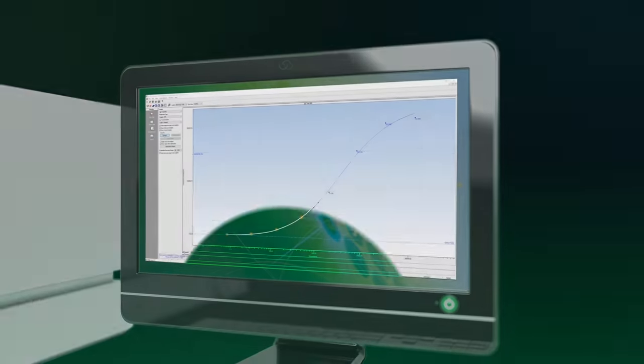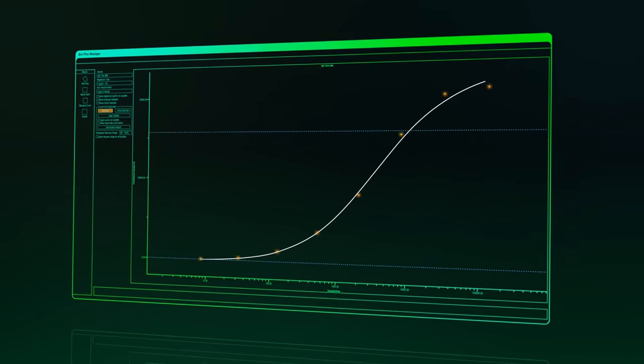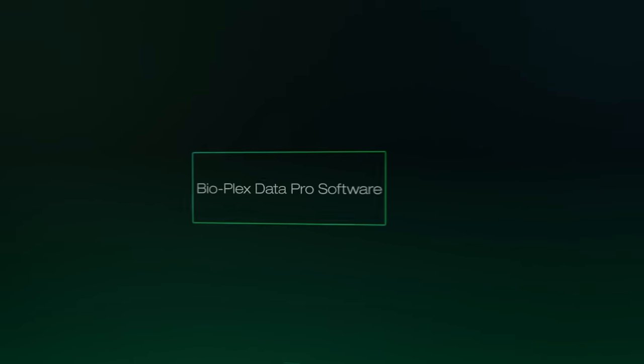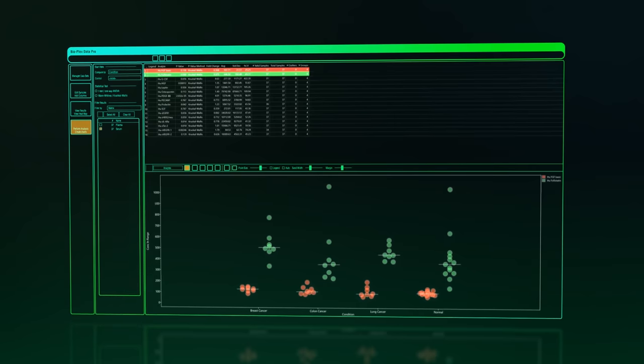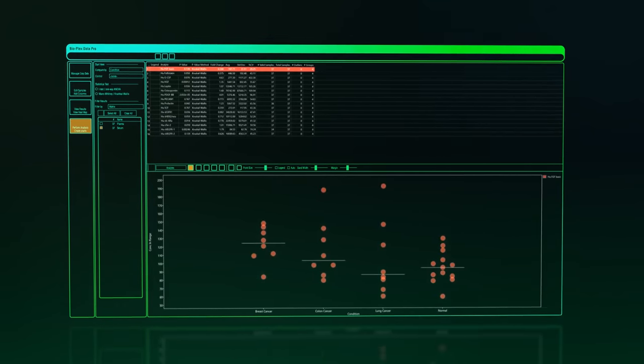Read the plate and analyze results in BioPlex Manager software. Optimize your standard curve with the touch of a button. Seamlessly transfer your data to BioPlex DataPro software in order to manage large datasets, add further sample information, and visualize and compare groups easily, allowing visualization options.